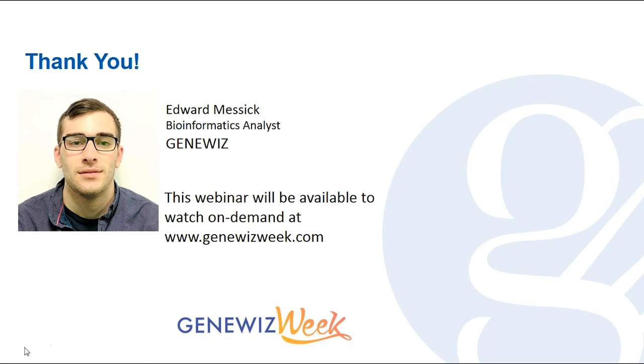So that's really the power of shotgun metagenomics, is that you can study every domain of microbial life at one time. It doesn't need to be separated into different analyses, and really the limitation on species is based on your database, and metagenomics can be used to find novel species. So in theory, you can find anything.